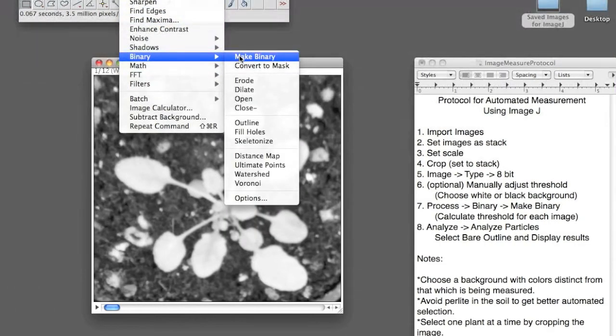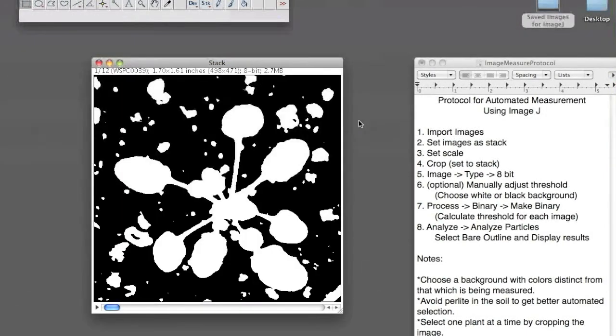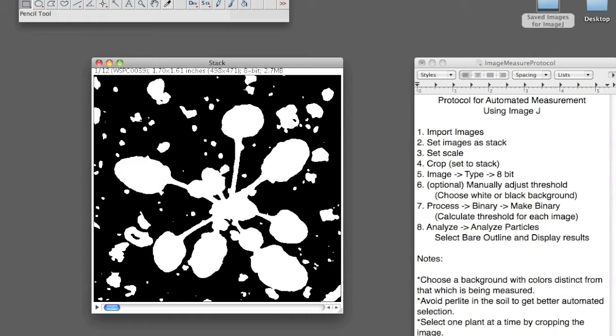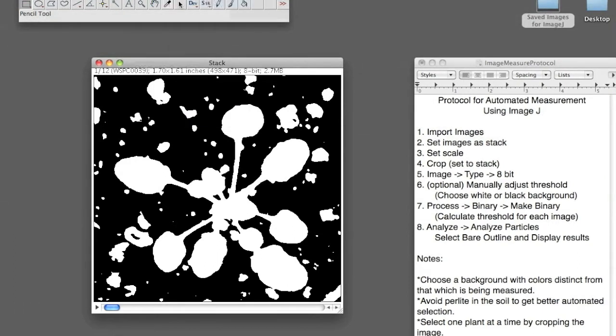And you can allow ImageJ to do auto-thresholds for you. However, the reason this image looks like this is because I used perlite in the growing medium, and when auto-thresholding, ImageJ cannot distinguish between perlite and leaves. So I wouldn't suggest using perlite or light-colored material in your growing medium. I didn't have the time to re-film, but if I did, that's what I would have done.